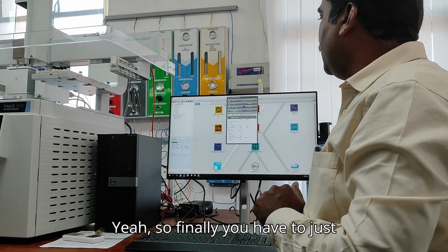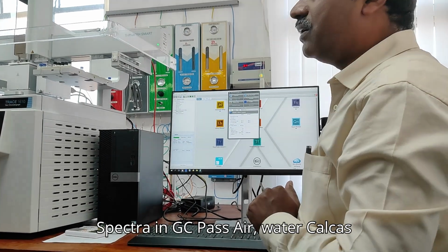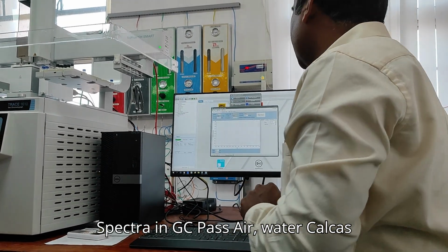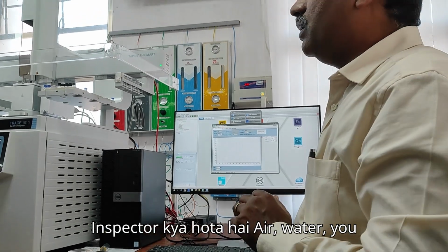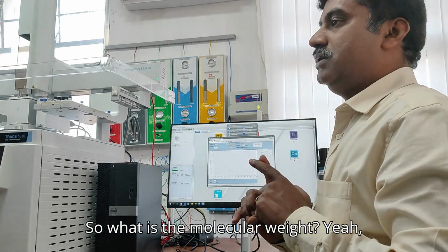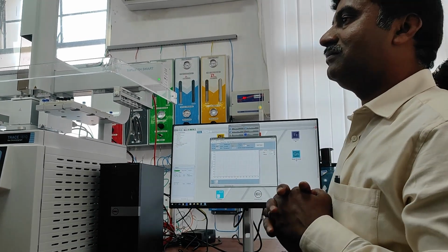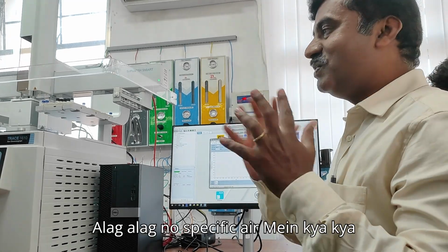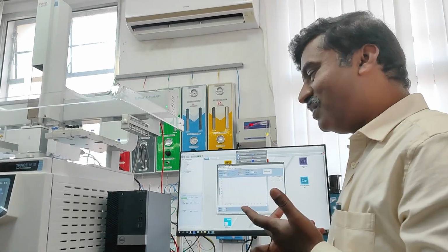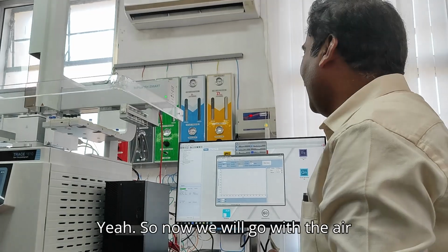Finally, you have to monitor the air, water and cal gas spectra in GCMS. What are air, water, cal gas spectra? You know the molecular weight of air and water. Water is 18. Air is different, not specific. What does air contain? Oxygen, nitrogen, carbon monoxide. Okay, so now we'll go with the air water spectra.